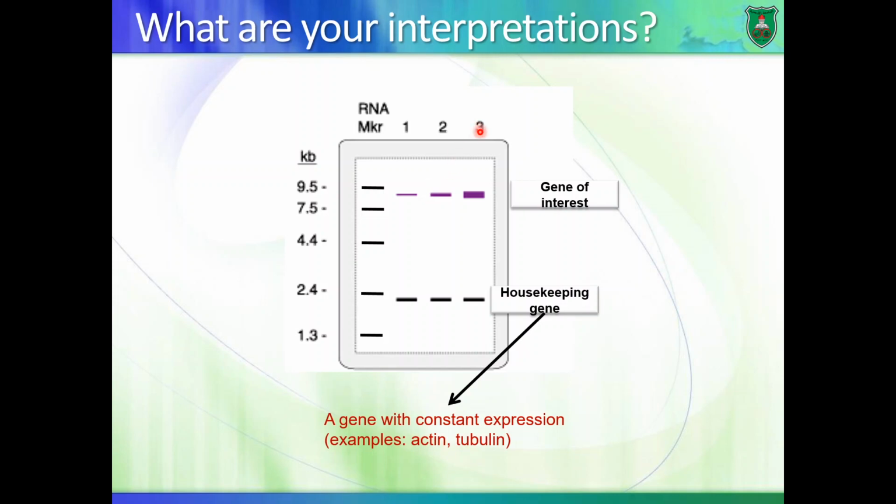In sample 3, we have no glucose whatsoever, and we have a lot of lactose. So there should be a lot of expression of the lac operon, and that's why the band is very thick. Well, someone might say, well, wait. I think you're fooling me.